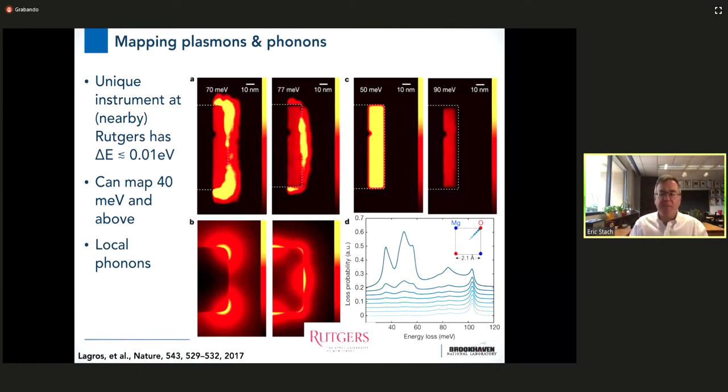But there's a whole field of electron microscopy that uses the electron microscope to characterize frozen samples and to understand their structure and chemistry. In fact, that methodology was what was awarded the Nobel Prize in Chemistry in 2017, as it improved to the point of being able to do it at the angstrom or atomic scale.